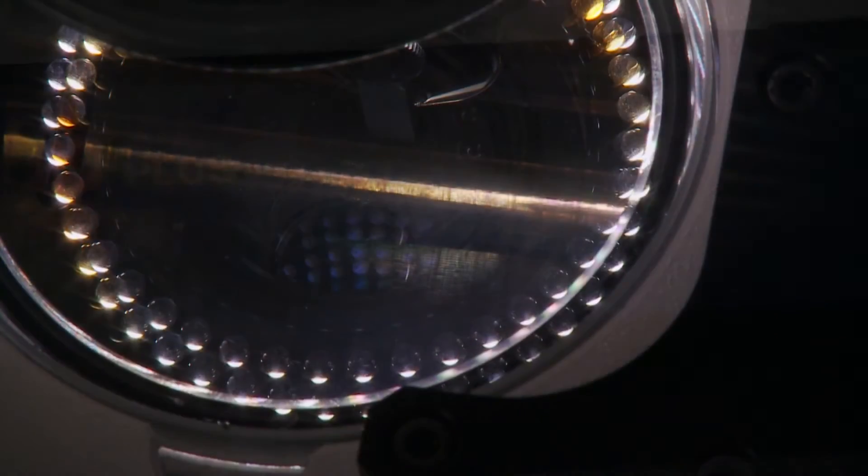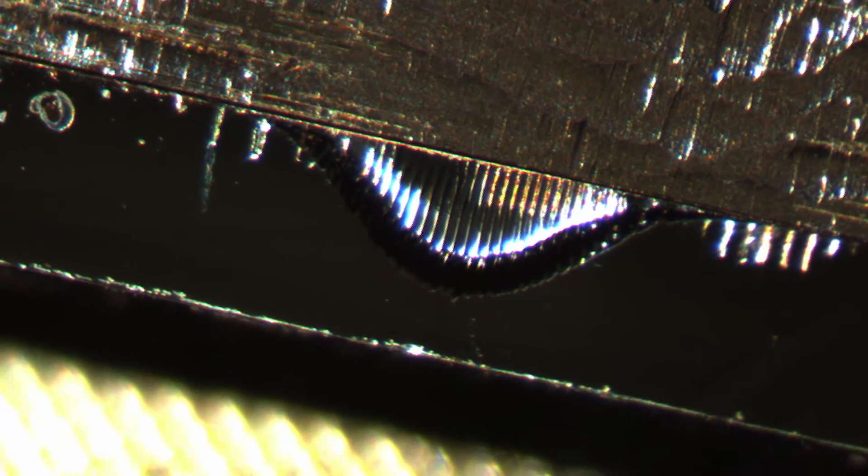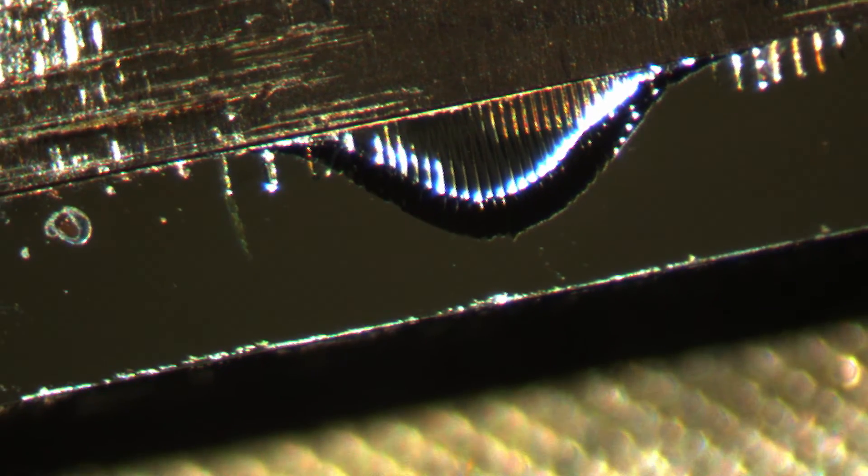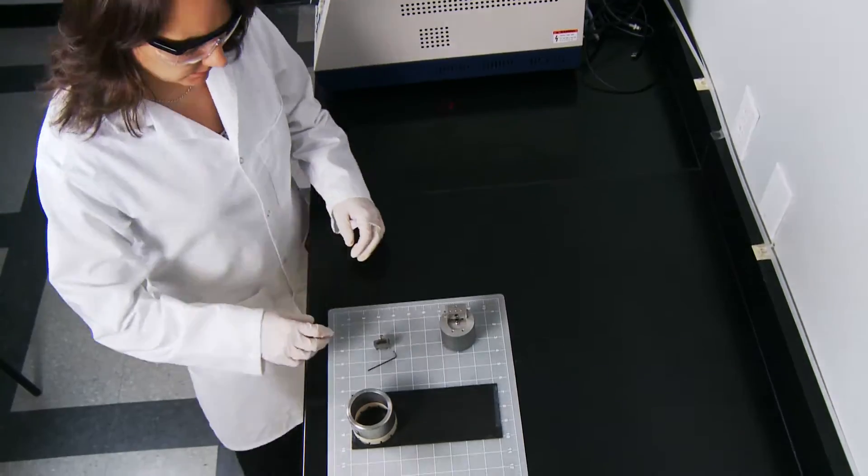The Ion 4000 Plus is born of Hitachi's desire to offer the ultimate system for sample preparation. Hitachi's hybrid instrument is the first of its kind to offer both cross-section and flat milling in one system combined with a host of capabilities such as cryogenic processing, air protection, and low temperature milling.